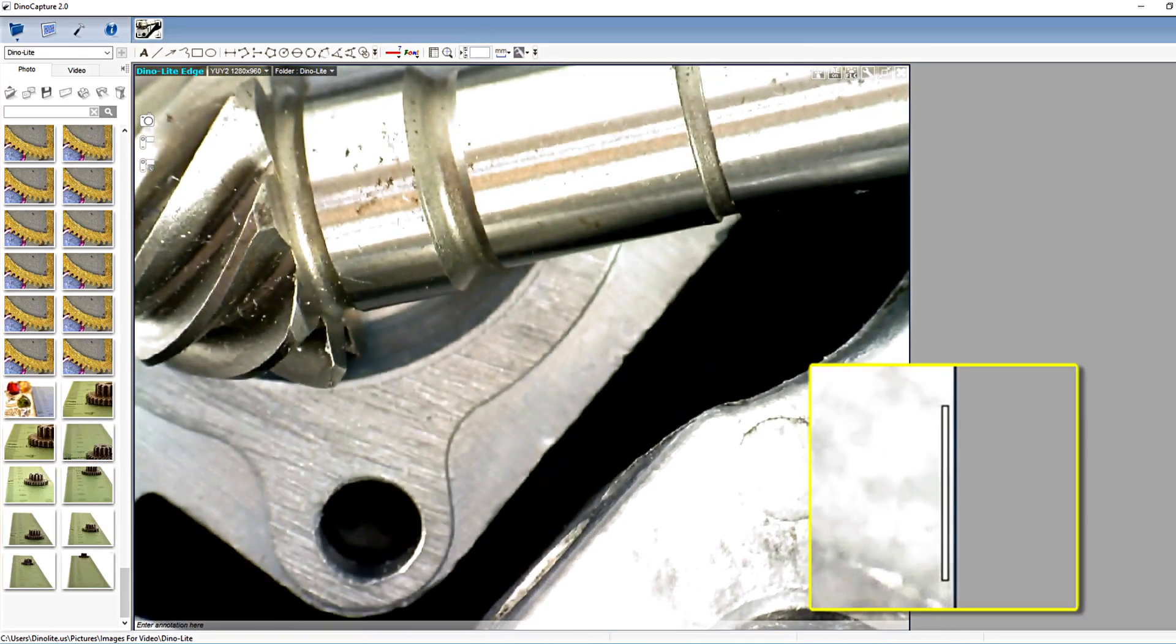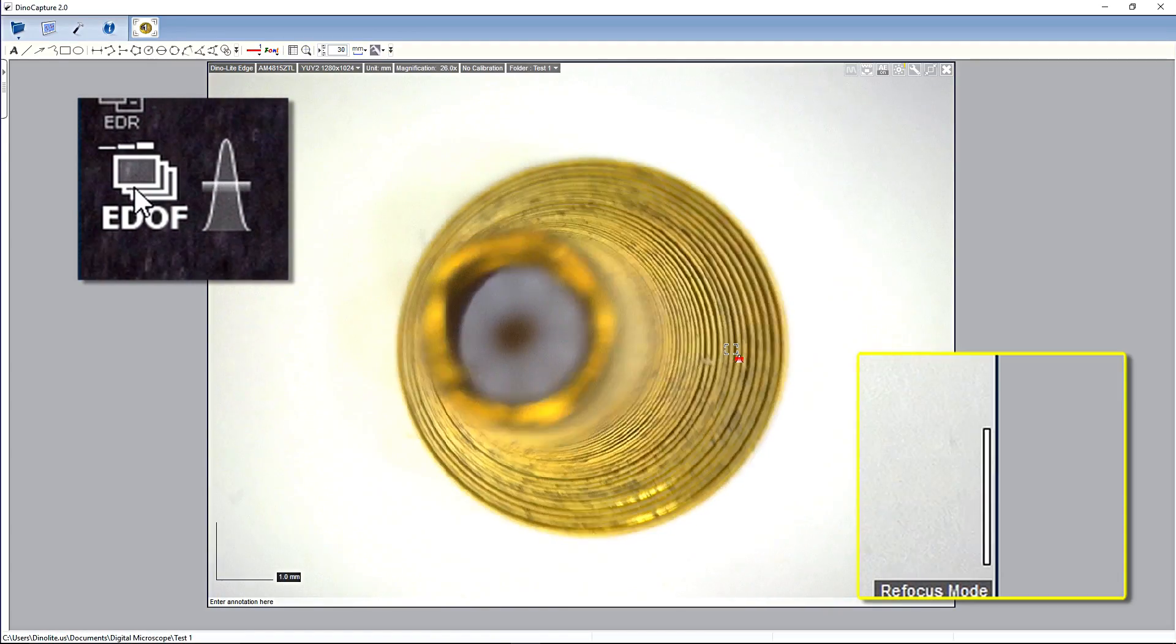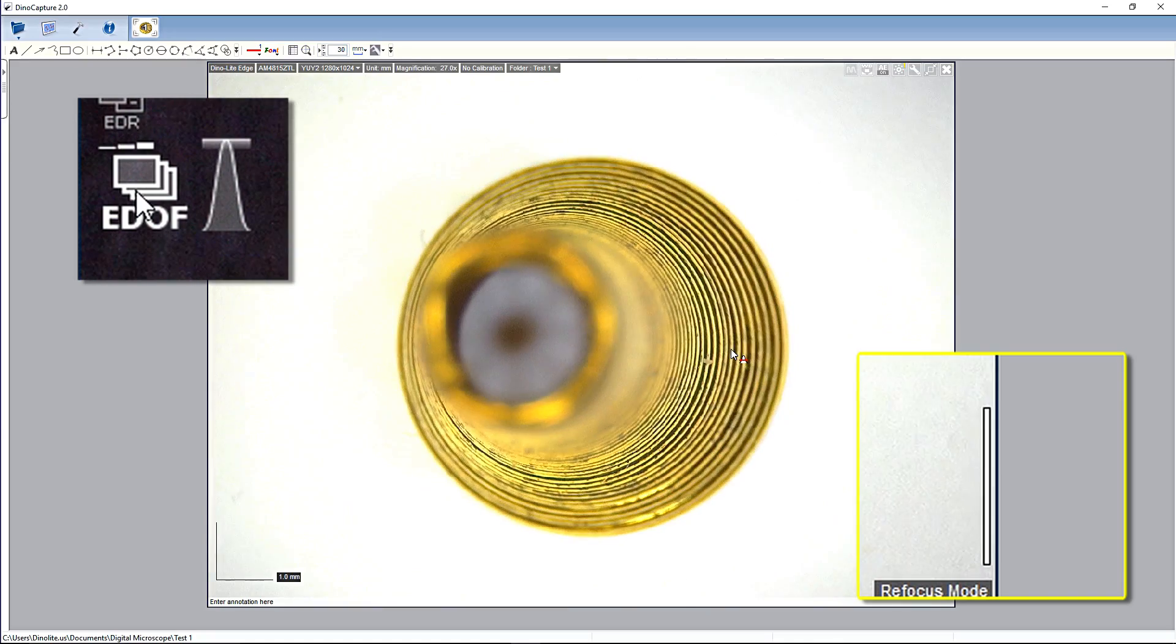In the live view window is a focus bar. This visual aid shows the level of focus. The longer the bar, the closer the image is to being in focus.